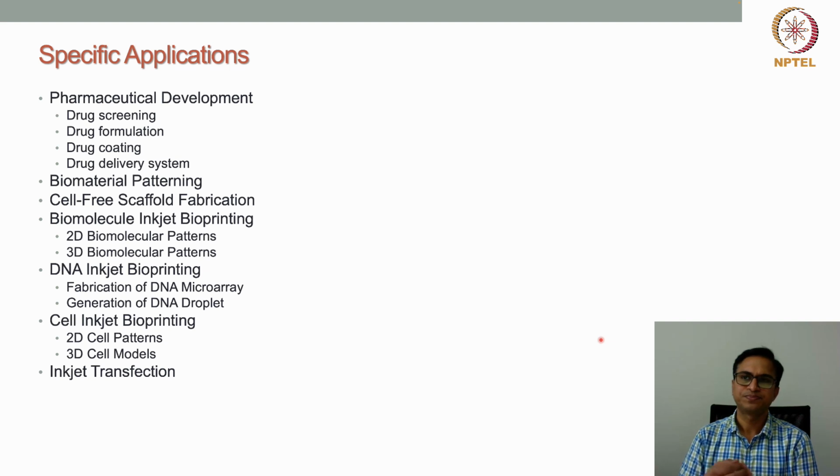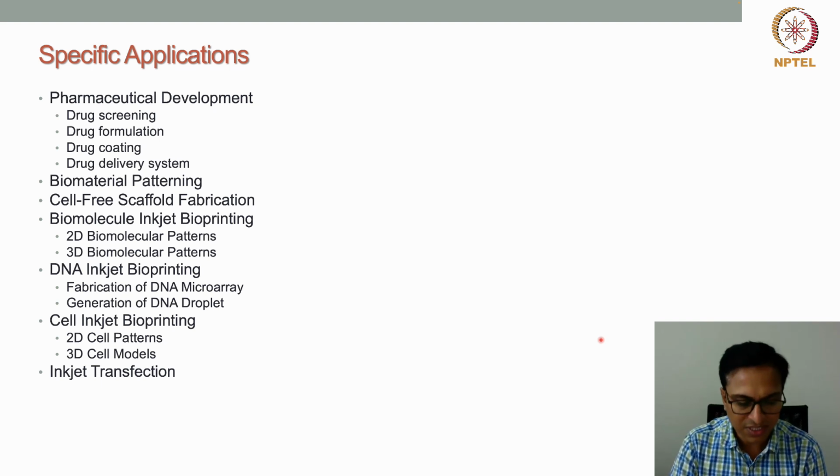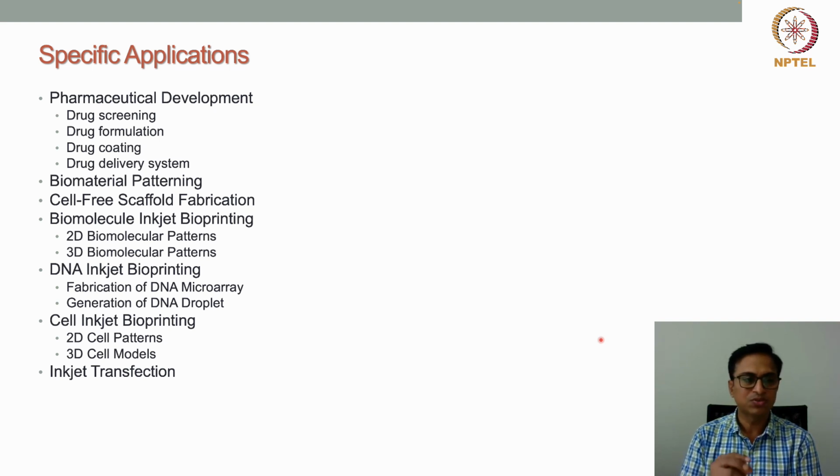are very reactive to certain environments and conditions. So the coating is an important phenomenon there, where the drug can be preserved or controlled. The other thing is, suppose our interest is to coat certain drugs with some material, so that the drug's dissolution can be prevented in certain areas. For this kind of application, drug coating can be used.